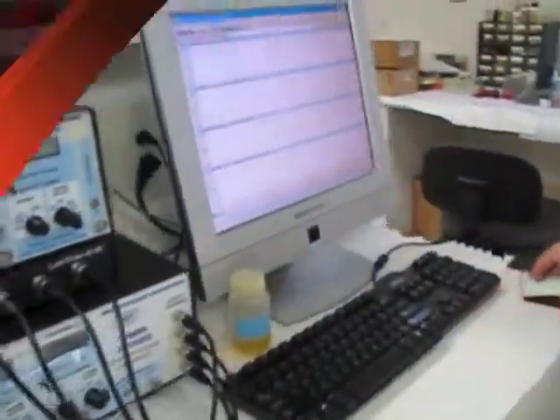Now we will start recording data. I hit record. On this one we are using channel 2, which will be right here where the cursor is. You can see just a little bit of the data being recorded as we speak.